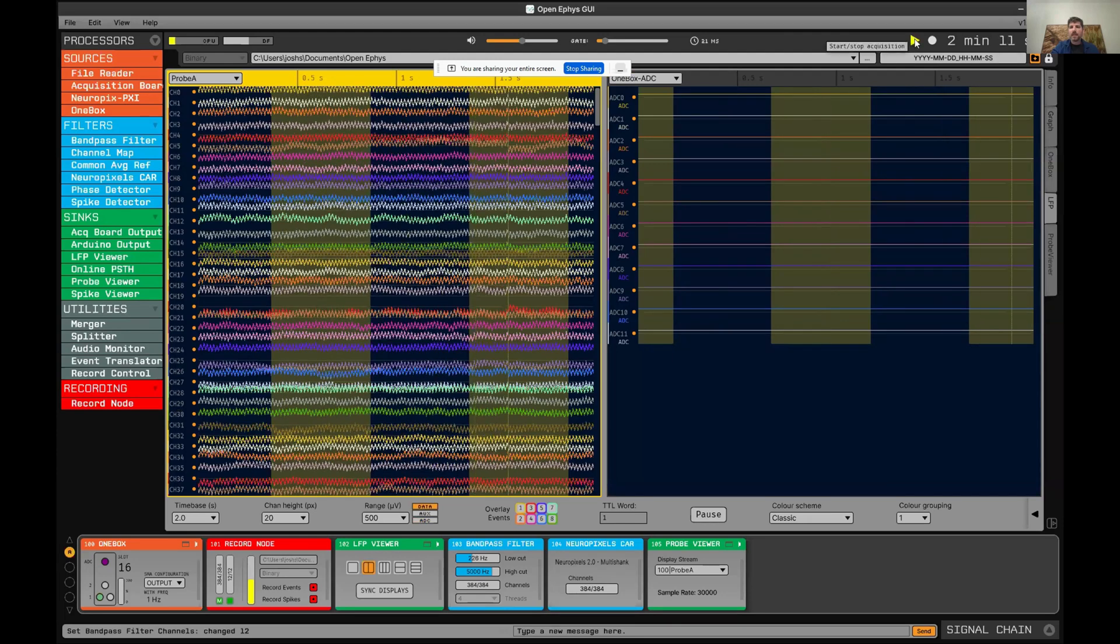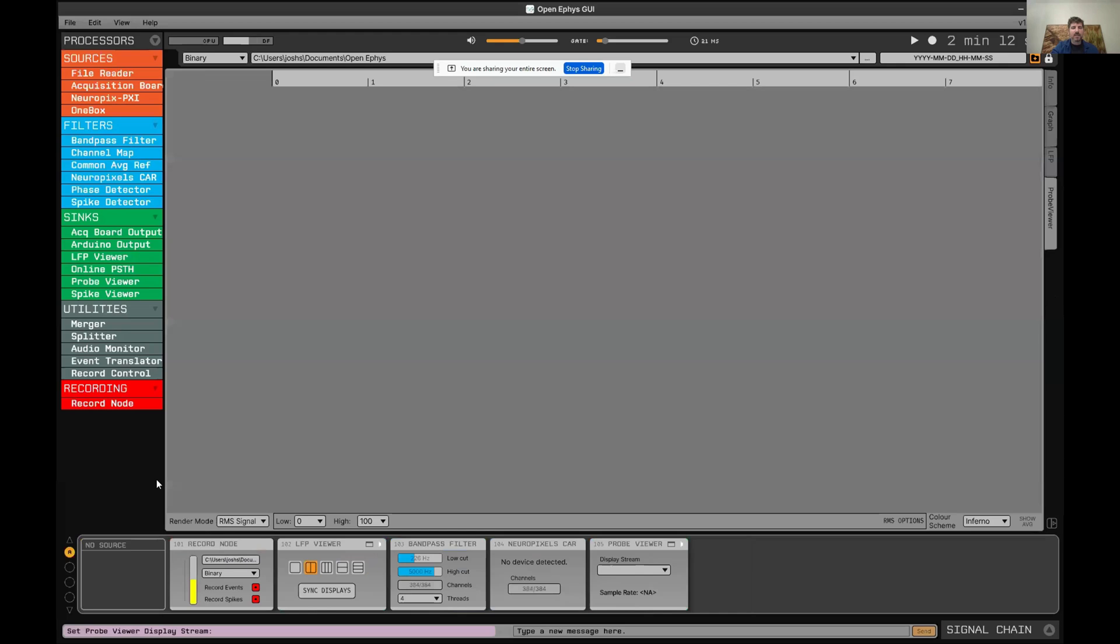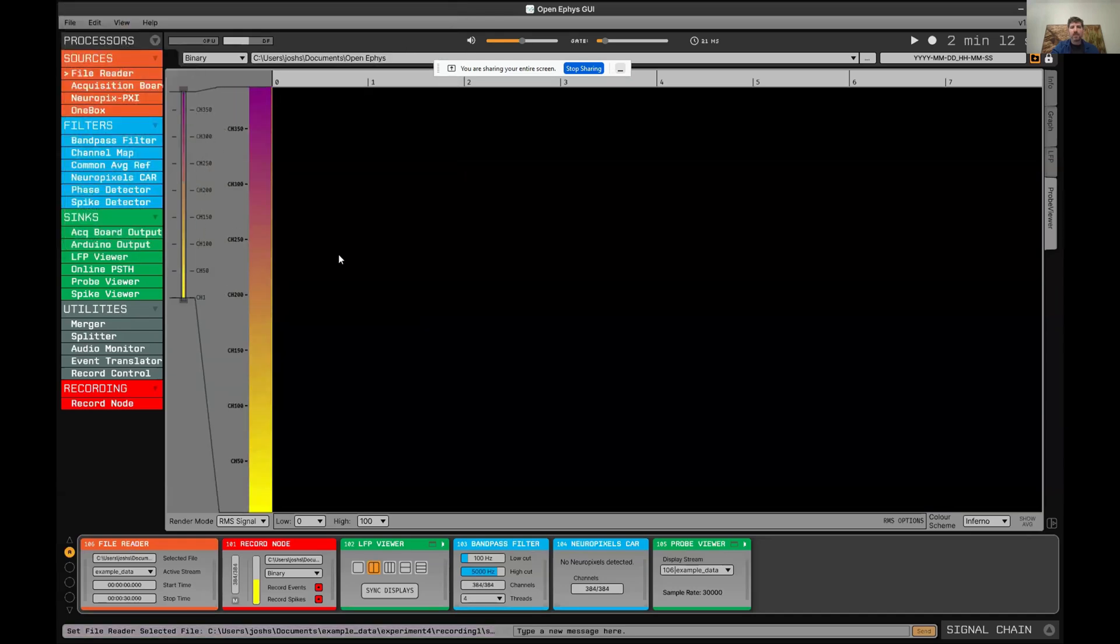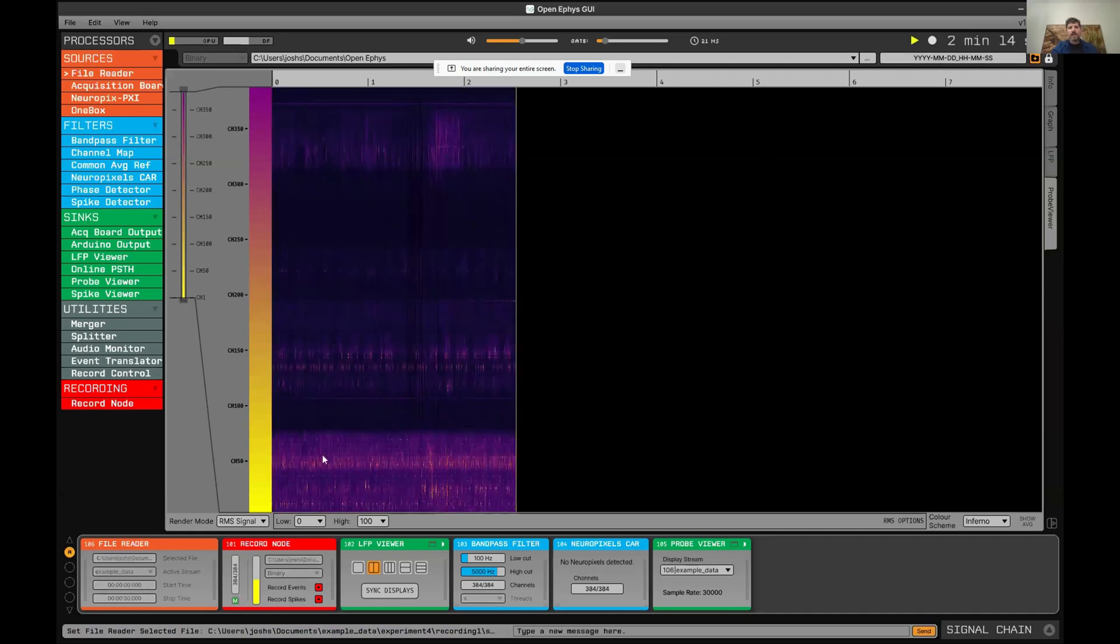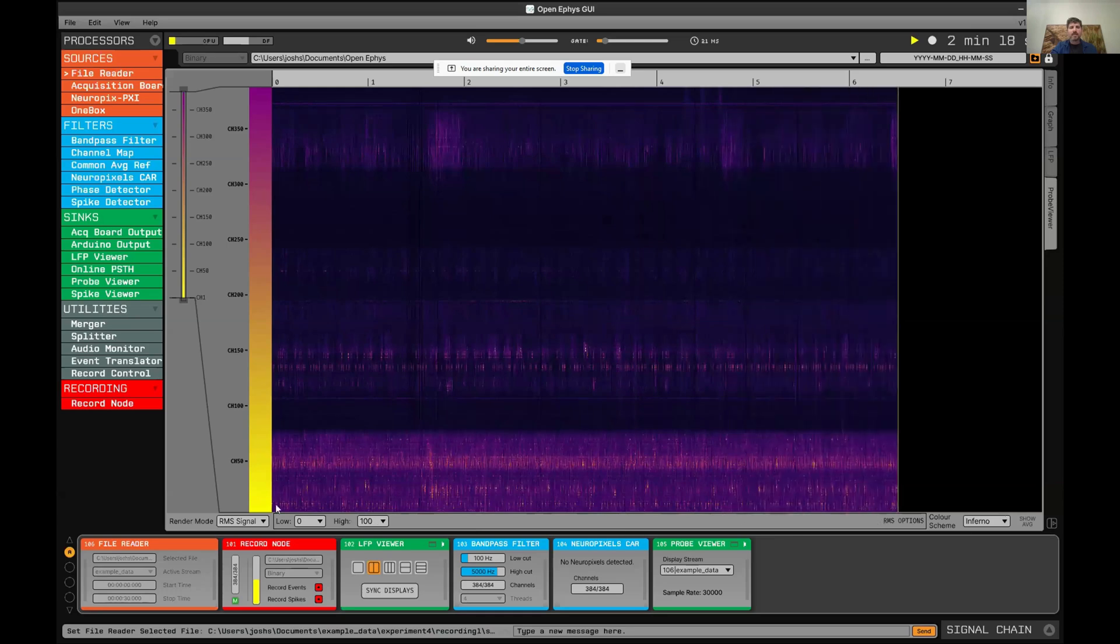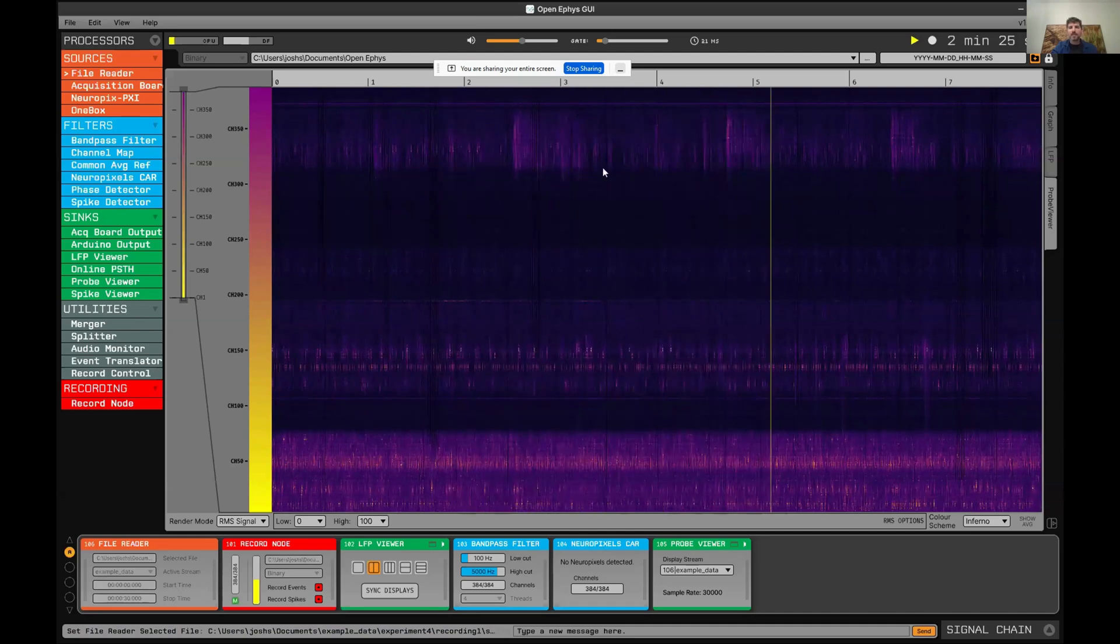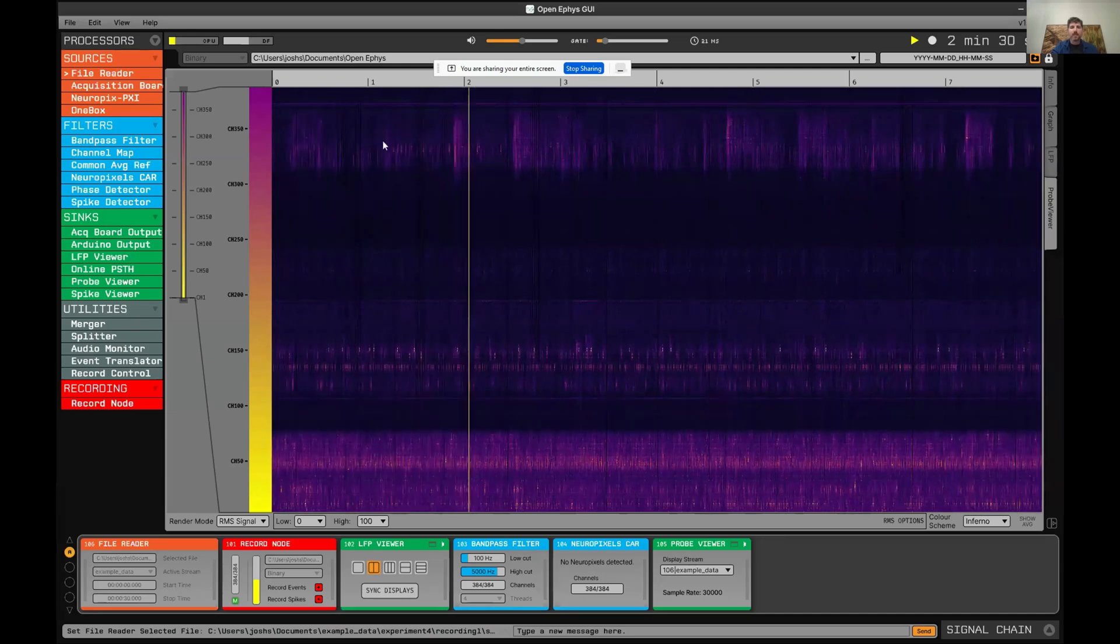The last thing I want to show is the probe viewer. I'm going to delete this OneBox and replace it with file reader and then load up some previously saved Neuropixels data. In this probe viewer interface, it will display the data as a heat map, time along this axis and channels along this axis. I think this is one of the most useful ways to visualize Neuropixels data. It makes it really easy to see the different structures that you are recording from.